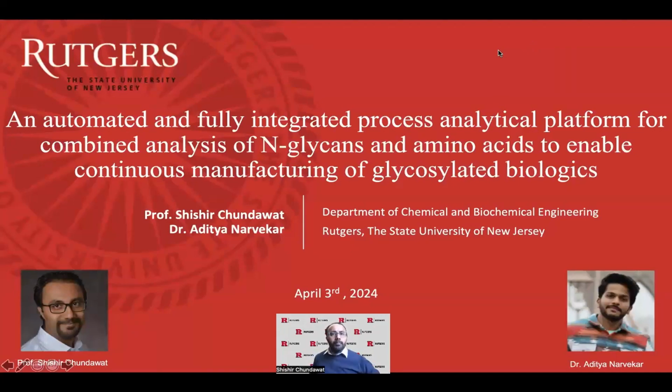Hello, I will be presenting this talk along with my postdoc, Dr. Aditya Narvekar, where we'll be sharing some updates with you on the N-glycanyzer workflow and how we've been using this platform for monitoring protein glycosylation and also amino acids to enable advanced and continuous manufacturing of glycosylated monoclonal antibodies.